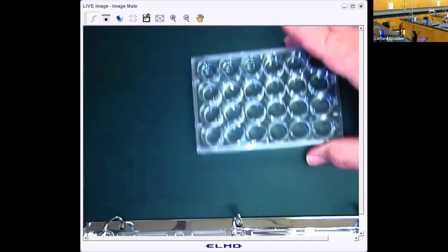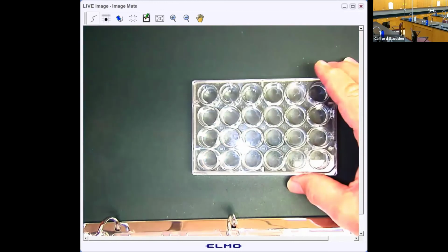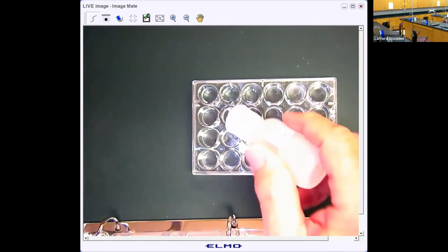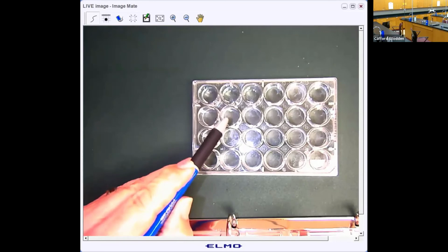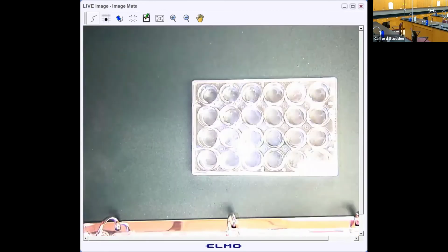That's the condensation. I want to redo the HCl with the ammonia, so that I can show you the smokiness that happens with that. So I'm just going to, right below this well plate, this is the one I already did, do exactly the same thing over here so that you can see that smokiness. Okay, so here's the ammonia.